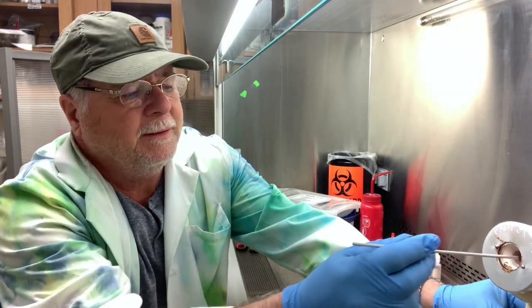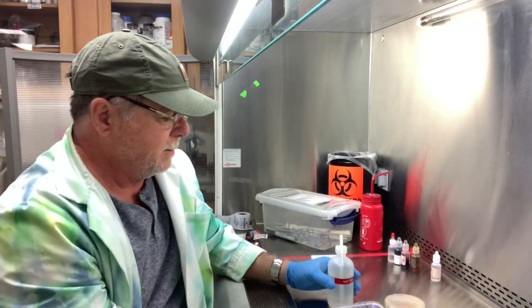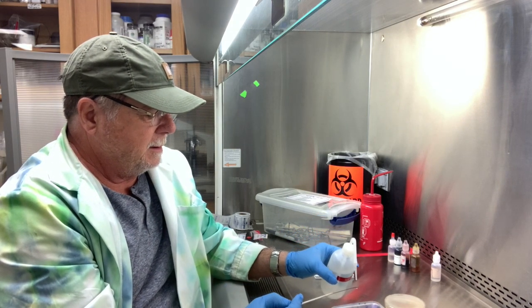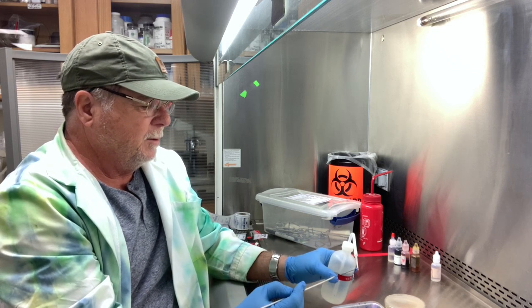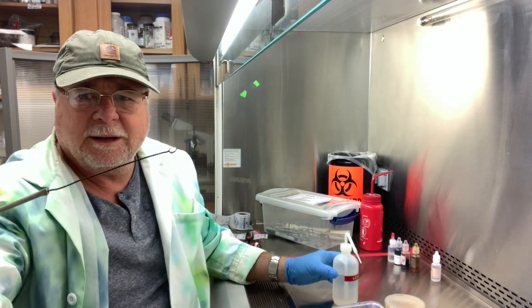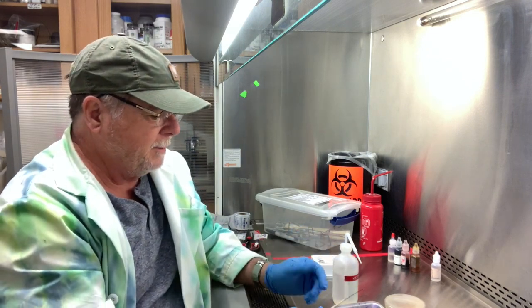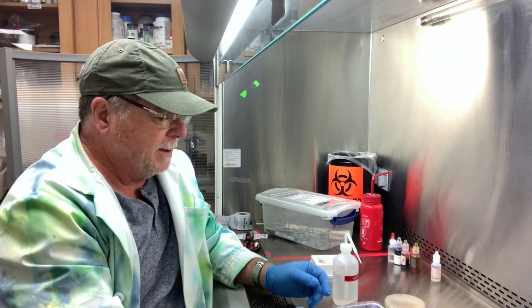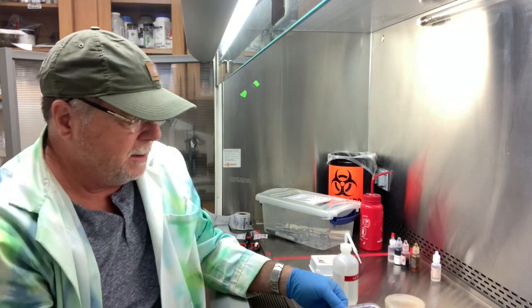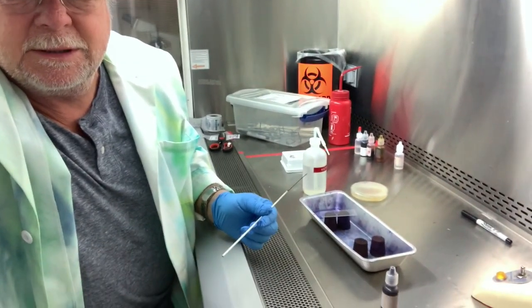for about 5 seconds and come out, and it's red hot. Then it'll cool off. Give it 5 seconds before you work with it. Then we're just going to squirt water over this loop until we get a drop that's inside the loop, and you can see it in here. We don't want a big drop hanging off, and you might have seen that I was tapping it a little bit to get the water off of it. Then we're going to press down on it. The pressing down is just to get the drop to come off. Let me turn this.